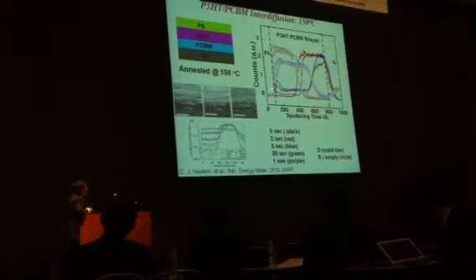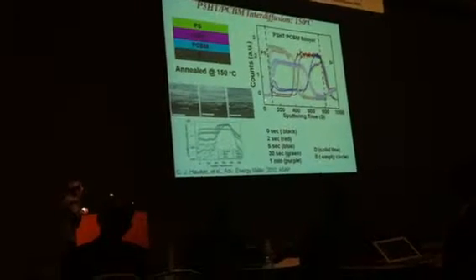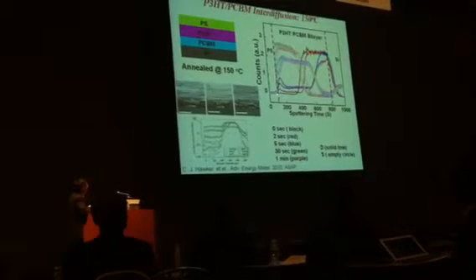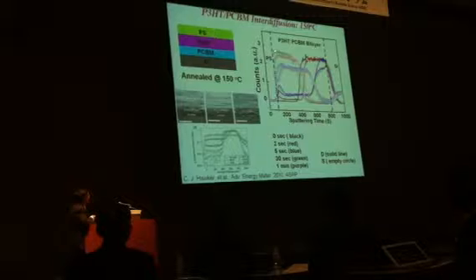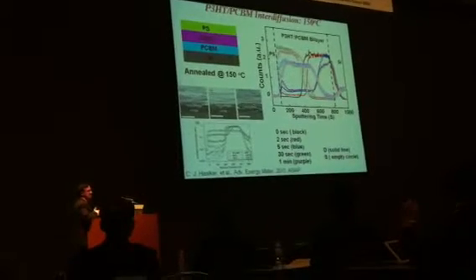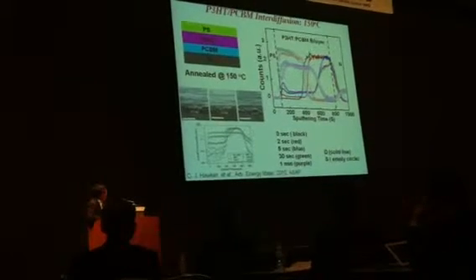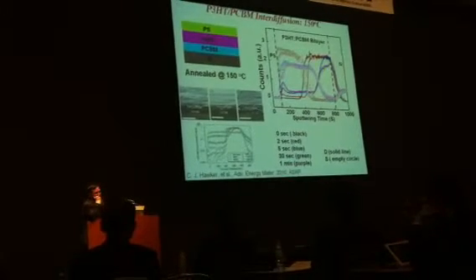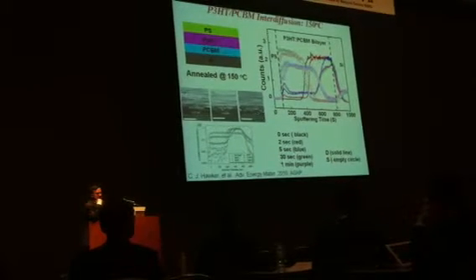All right, we start off initially with the black, which is the PCBM deuterium concentration. There's nothing, and then you get into the PCBM layer. P3HT, on the other hand, and this is the sulfur signal, we can see the P3HT, and then when we get into the PCBM layer, we have nothing. That's simple. We take the sample and we heat it, basically for 2 seconds. Each of these layers is about a tenth of a micron thick, 100 nanometers.